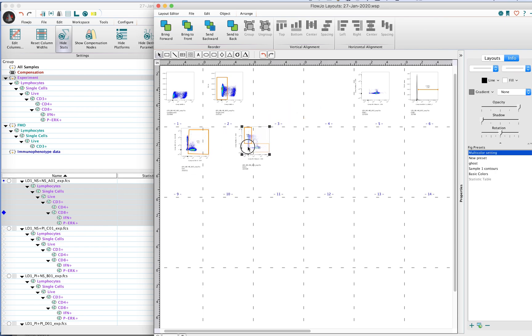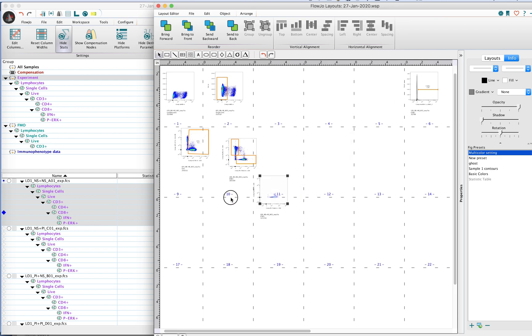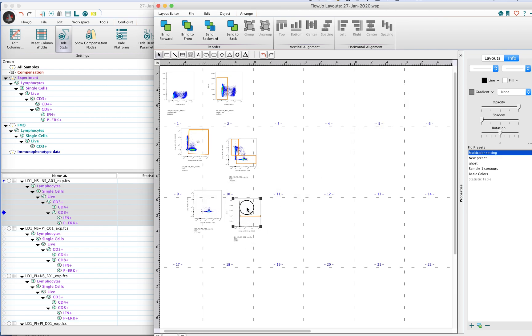Maybe we want a couple of rows. We've got a couple plots down here. Let's go ahead and add a third one so we can look at some of those other tools.